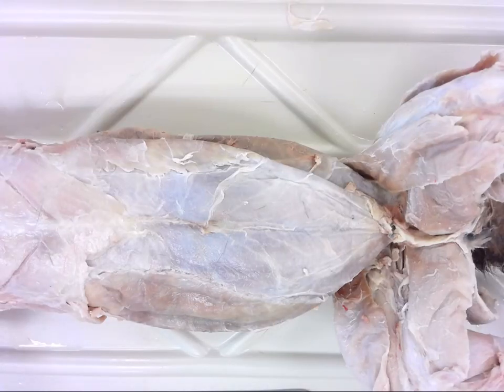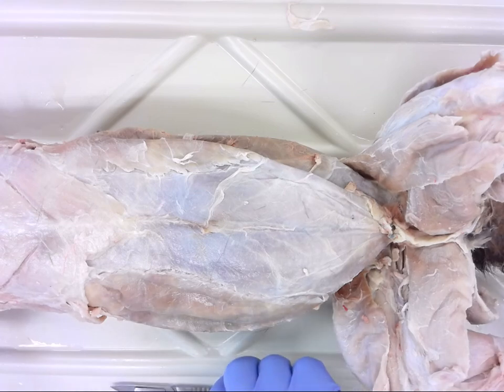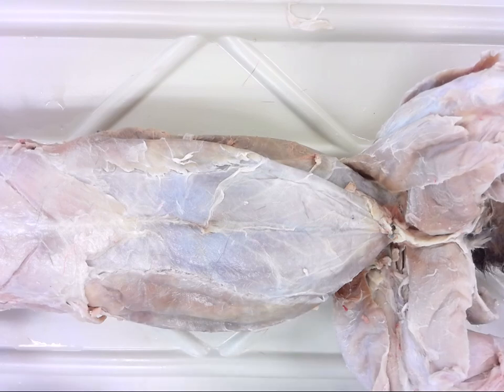Alright class, this video is going to be aimed at taking a look at opening the abdominal cavity as well as identifying some gross anatomy that we're going to find within. I will get into more detail on the specifics of some of these in subsequent videos and provide a little more depth. But for now, let's just get inside.